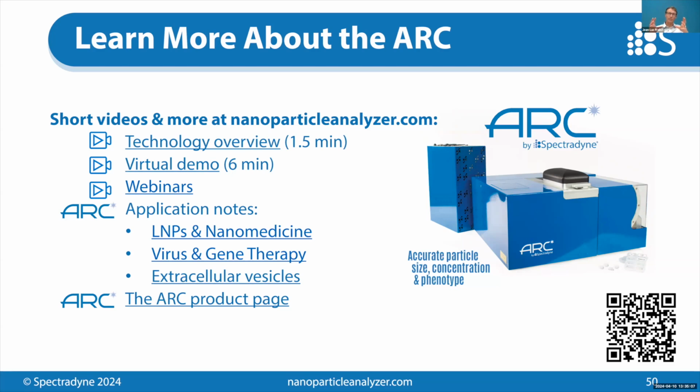So we typically measure close to what a TEM measurement would say, rather than what an NTA or DLS measurement would say. Those measure hydrodynamic radius, right? So what we're measuring directly is the volume of the particle that is excluded as it passes through the constriction. So we're measuring the physical size, the physical volume of each particle as it goes through. Hope that answers your question.